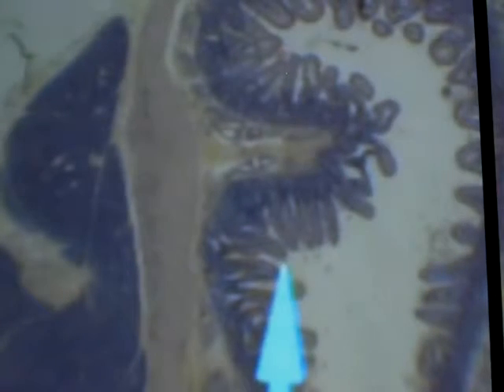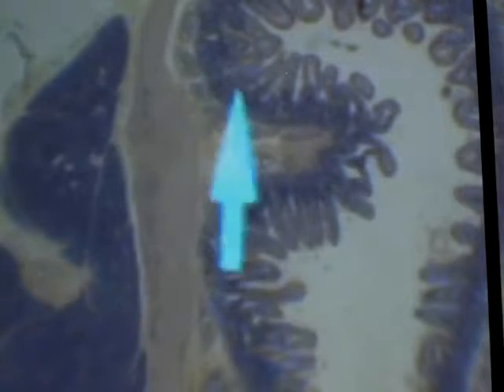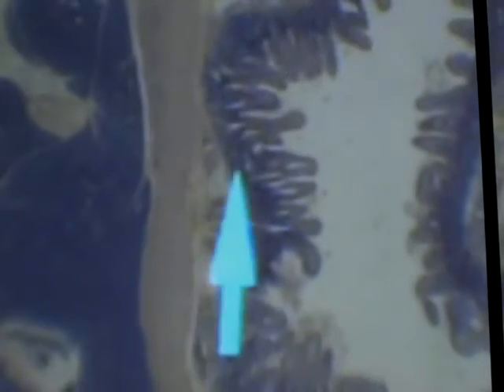That pretty much is to increase the surface area within the intestines. From the plicae circularis, you're still going to have your villi projecting outwards. This is a little bit of a plicae circularis here, and we have another one over here.